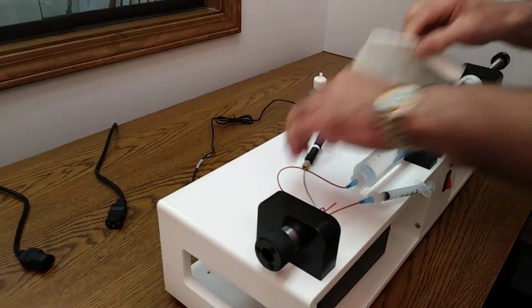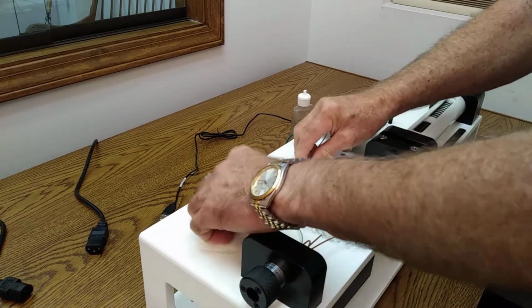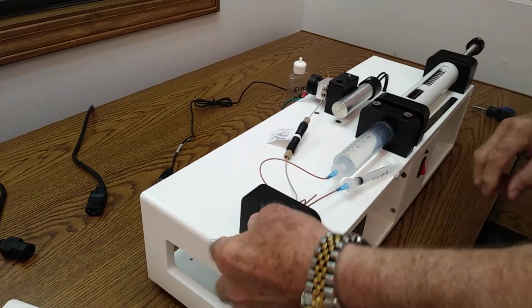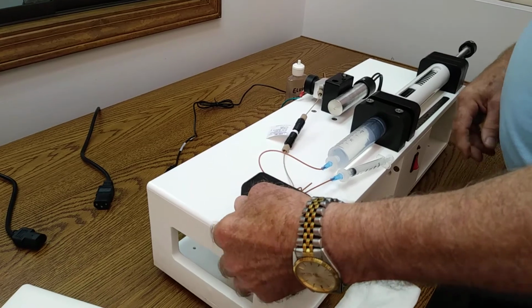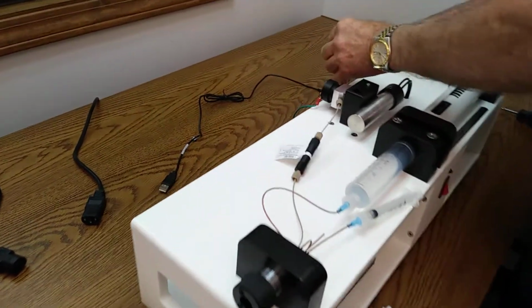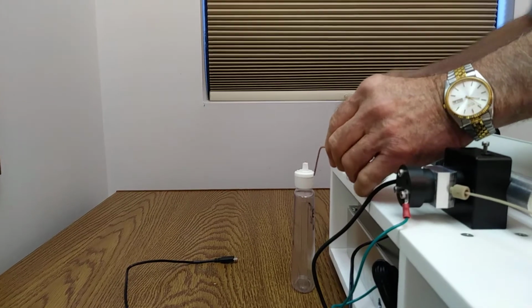Take a paper towel and swab up the leak. Wipe this all off and get it nice and clean. Rotate that back and forth a time or two. And now we will have flow going all the way through and dripping out the back of the instrument. In a minute or so, you should see some flow back here.